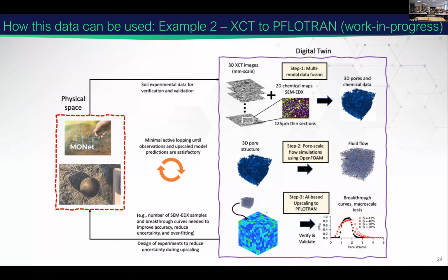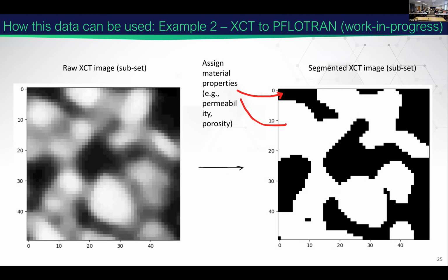And your workflow will be able to predict and understand how these breakthrough curves happen. So we have been developing this multi-step digital twin approach, and these workflows will be made available to the MONet users on EMSL Tahoma. That's our major goal. Tomorrow I'll be showing a part of this step 1 workflow: given an XCT image, how you can use open source software or a Python set of tools to do the segmentation of the XCT image. Let me go into the specific aspects that we'll discuss tomorrow.